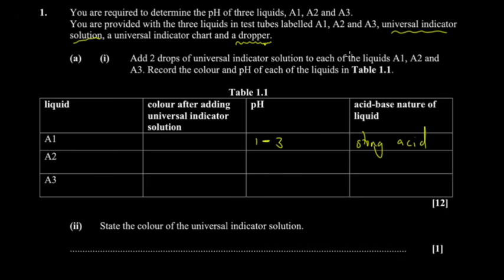And then as for the precautions, you use a standard pH chart. Just like I told you, don't use anything else. Use the universal indicator chart that you're given. There are variations of the universal indicator charts out there, depending on what solution you're using. But use the standard that you're given, and also depending on the accuracy. And then use a different dropper. Obviously, we talked about this. Don't use this dropper to take any of the 3 liquids out. You'll be contaminating the universal indicator solution.